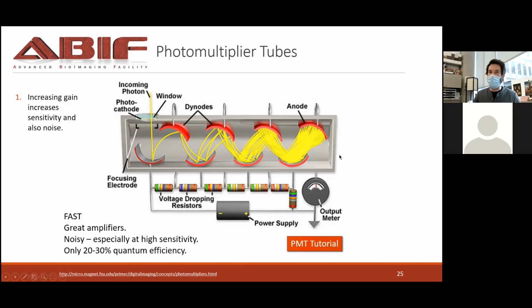A camera needs a minimum of usually around 5 milliseconds to take a picture, so you would not be able to take 1,000,000 tiny pictures so quickly on a confocal. And this is really just to stress that you're only getting the information from 1 pixel. It will measure the first pixel, and then as your laser moves around, we'll get the information from other spatial areas, and slowly the computer will then rebuild the image from that sequence of light measurements, if you will.